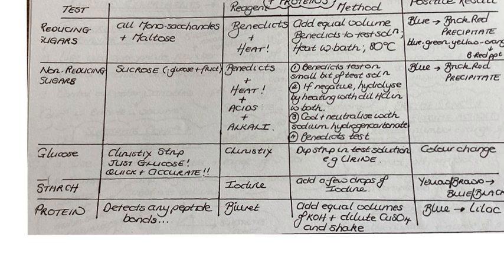The next test I want to talk about then is the starch test, which you all know. So starch is a polysaccharide, and the reagent that you use to test for it is iodine. Now remember, I want you to say that iodine is yellow-brown. So what is the method? You have your test solution, you just need to add a few drops of iodine, and if the test solution does contain starch, the iodine will change from yellow-brown to blue-black.